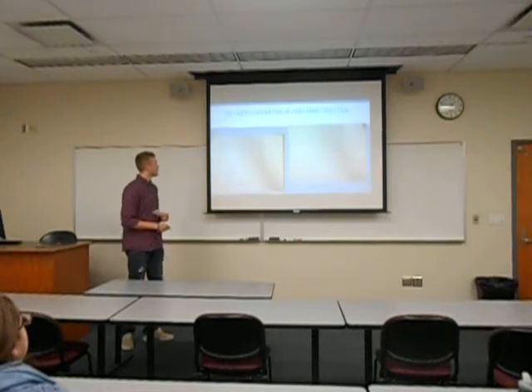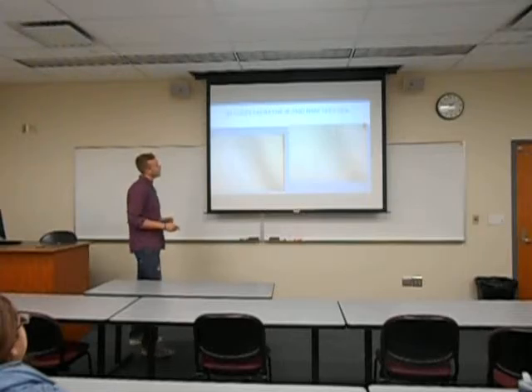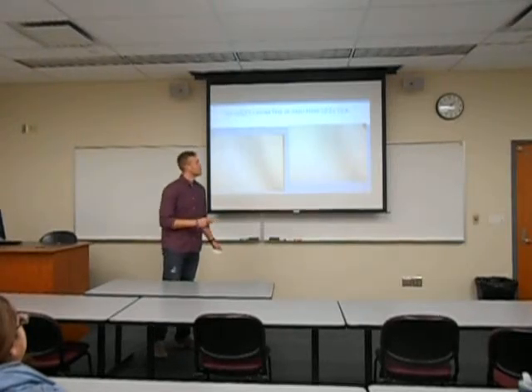Here are the results. So for 48A, I found an OH right there, and then I also found a CH singly bonded. And then for the peaks, you see there are two peaks because it goes up and down twice. And right next to the peaks were numbers, so that was 1 and that was 3. So my ratio was 3 to 1.